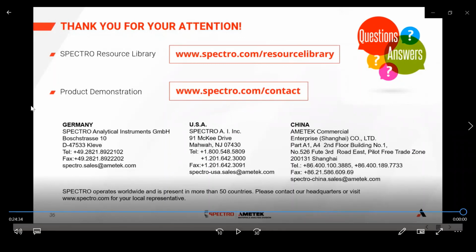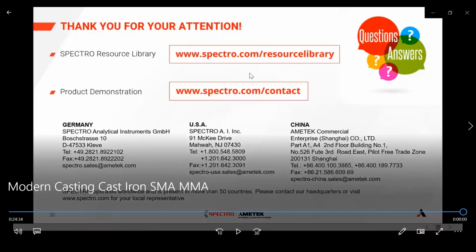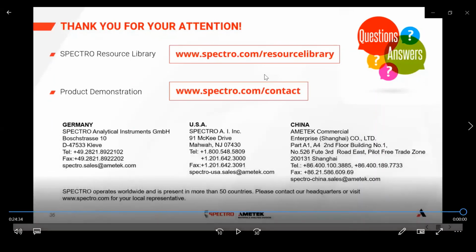I have had this question: is the technique possible for handheld? And I would consider that also for portable devices like our SpectroTest and SpectroPort. They do not have the wavelength range, nor do they have the background processing power to monitor those wavelengths quickly enough to capture that spiky behavior in the pre-spark.